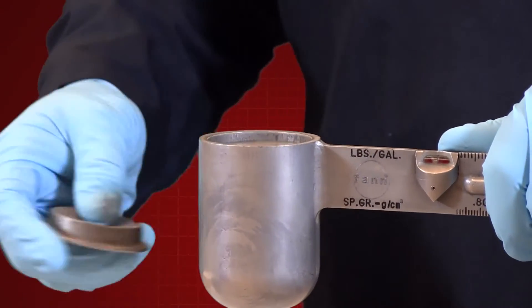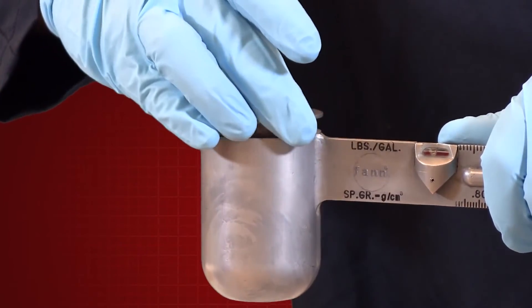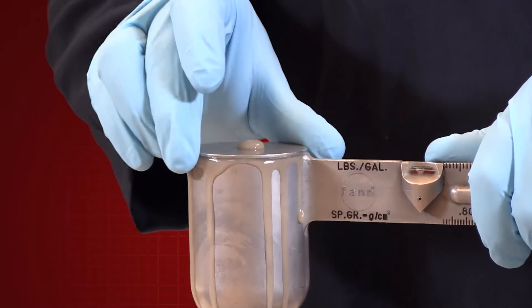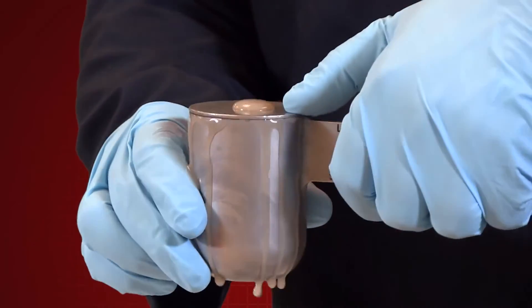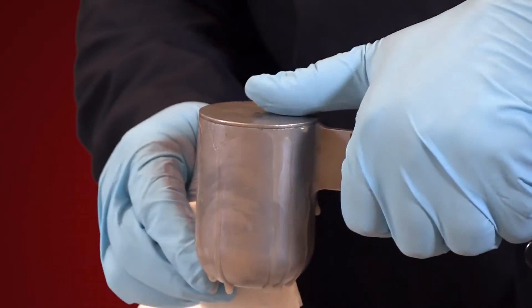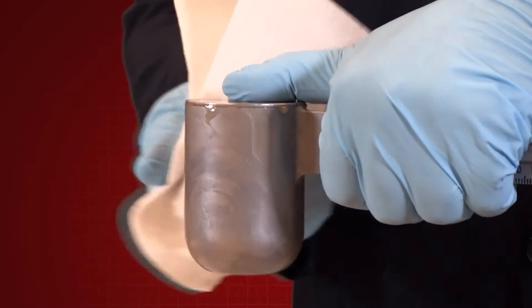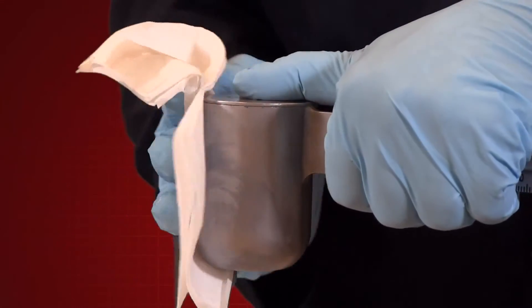Put the cap on the filled drilling fluid cup and rotate the cap until it is firmly seated. Ensure that some of the drilling fluid is expelled through the hole in the cap in order to free any trapped air or gas. Then, holding the cap firmly on the drilling fluid cup with the cap hole covered, wash or wipe the outside of the cup clean and dry.